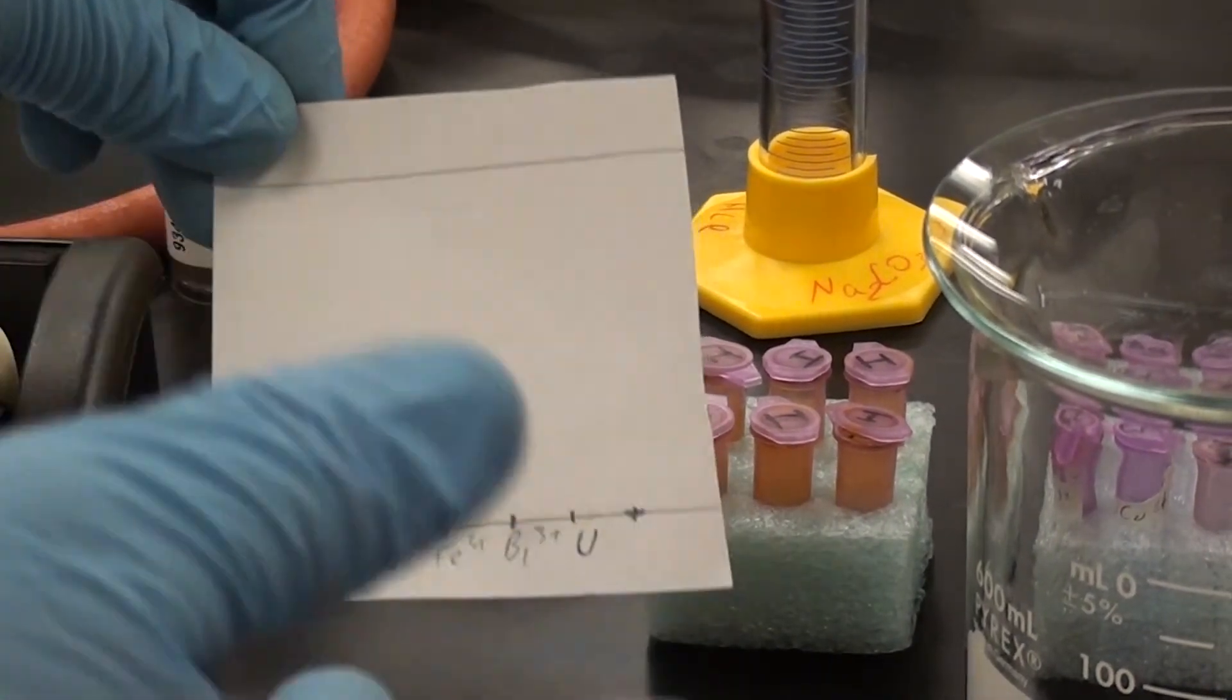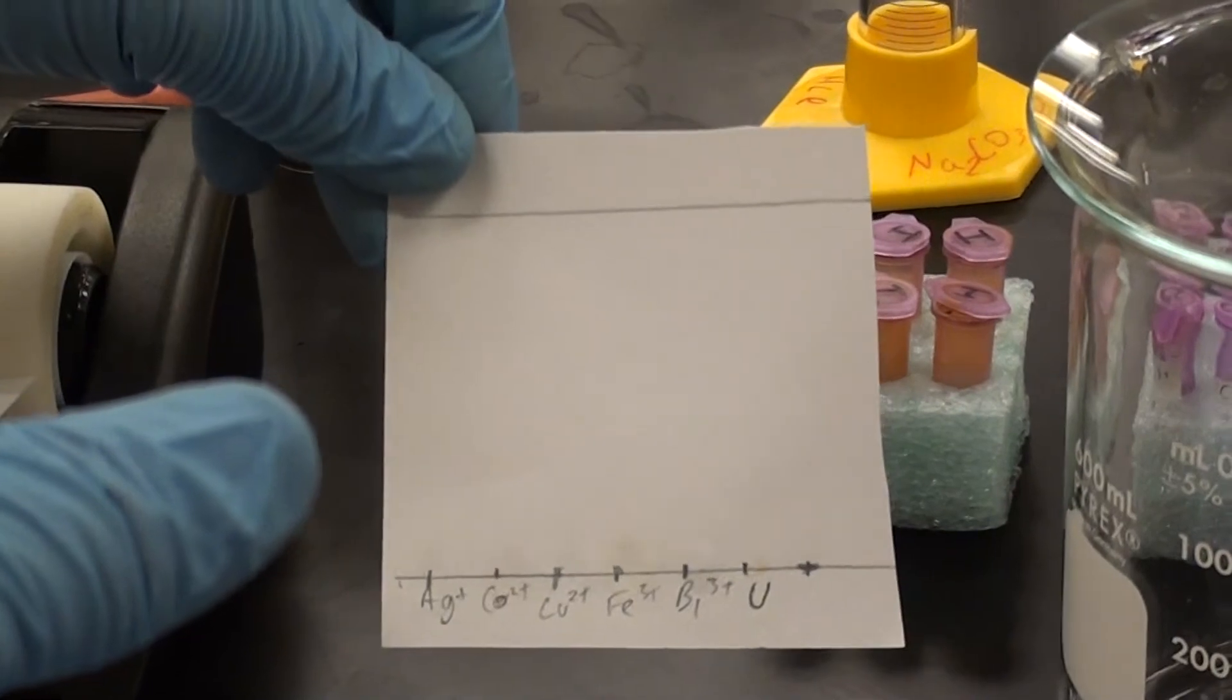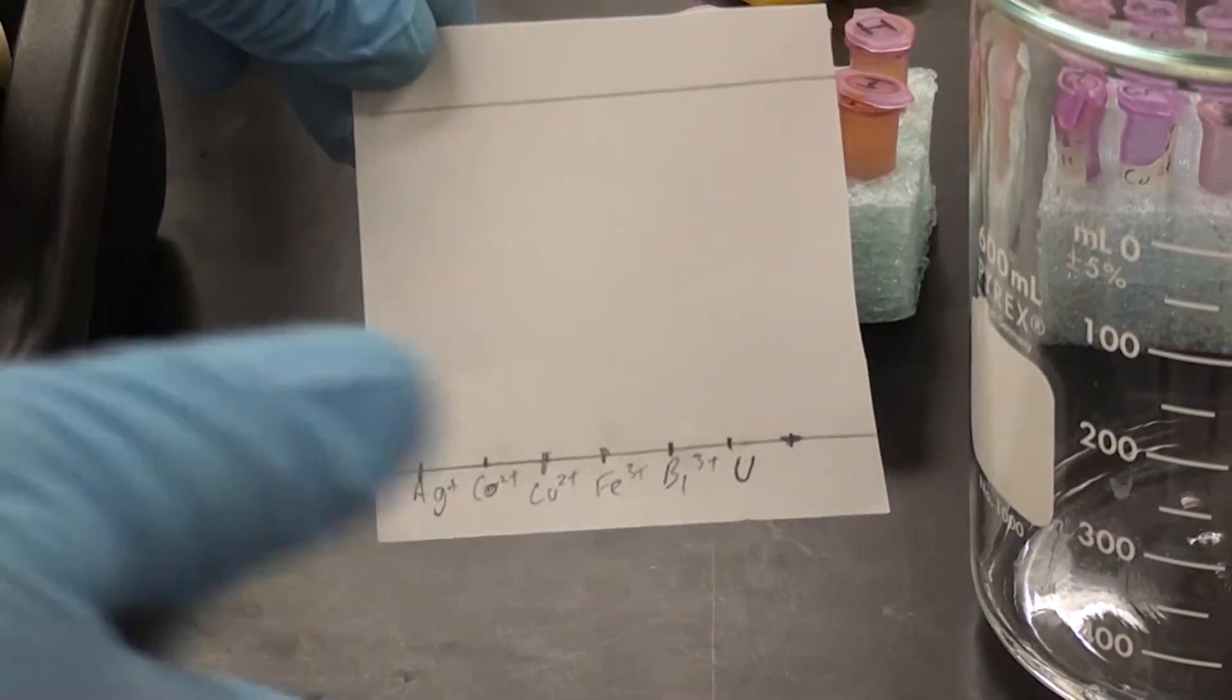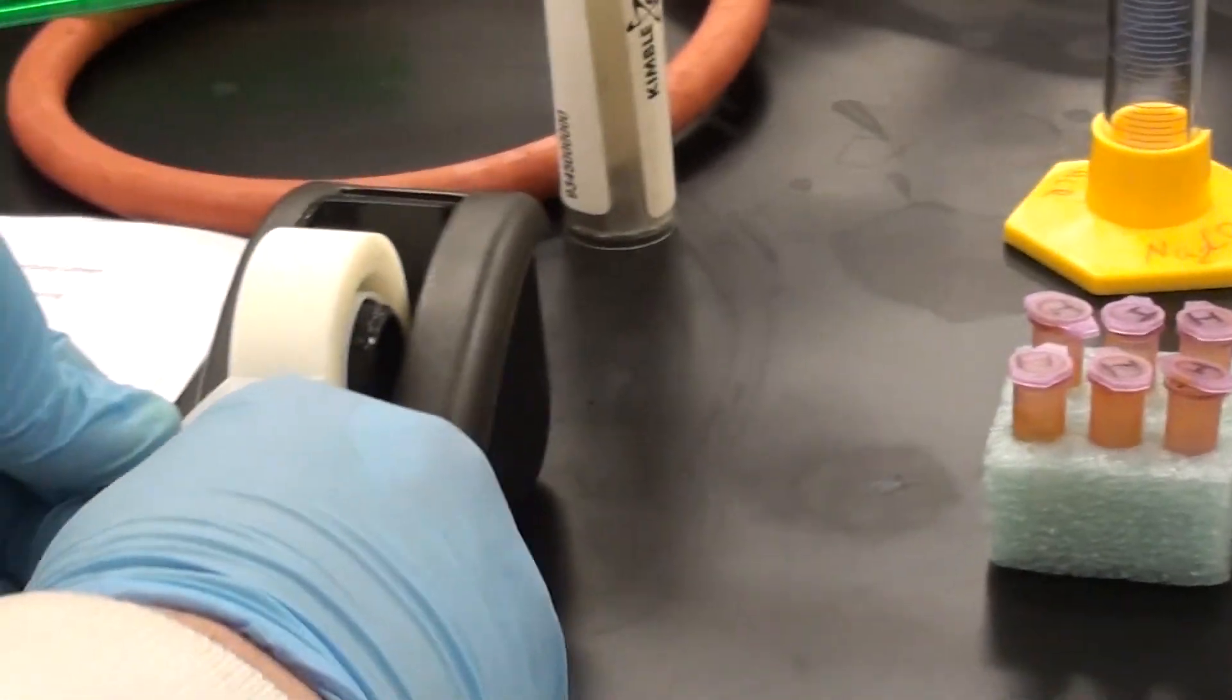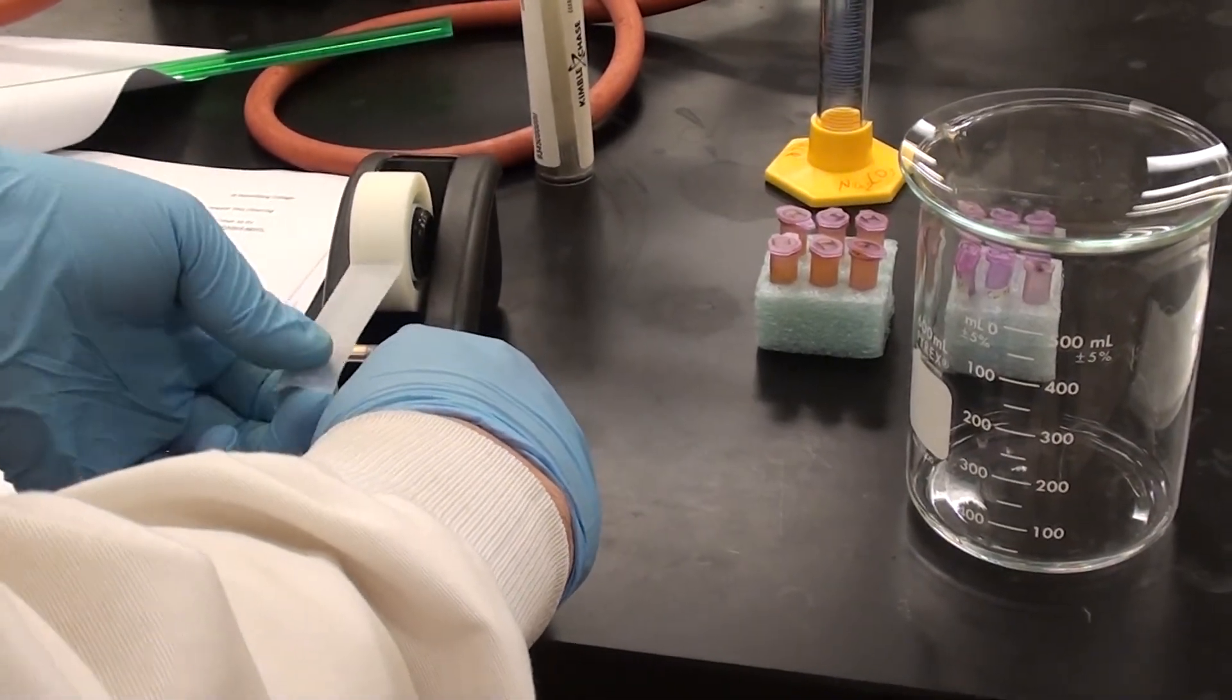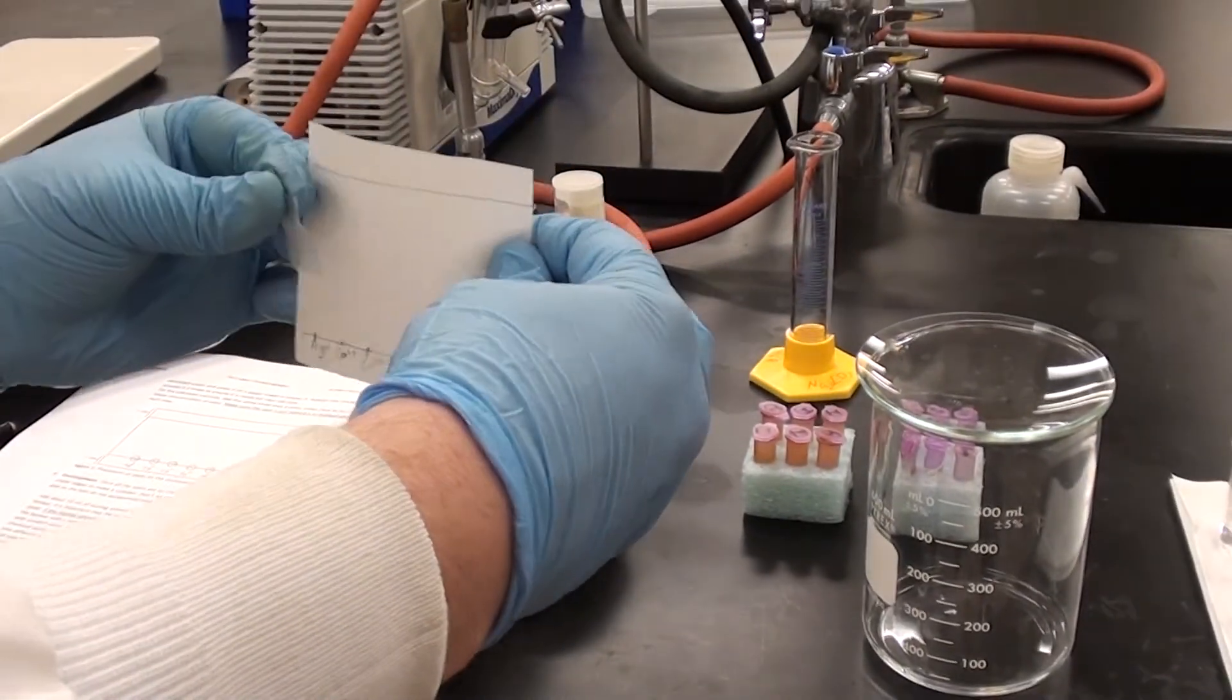Now, one thing you can do, it's kind of optional really for this because this could probably fit in the eluting container, in the developing container, and it probably wouldn't really need tape. But optionally what you can do, you can take some tape here and you can make this into a little cylinder.